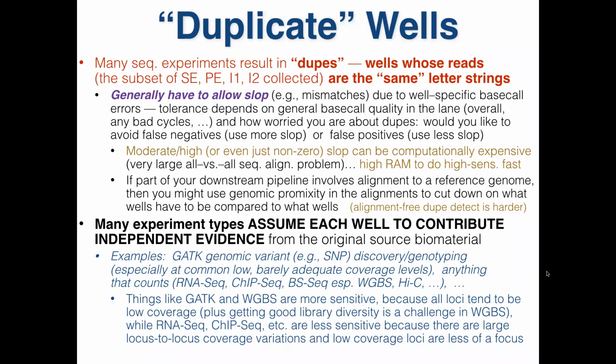that is one of the things that makes these hard to deal with, because if you haven't done anything else, you're very early in the processing of the lane, you haven't done alignment, maybe you're not even in a situation where alignments are a thing you're doing. I mean, the great divide in sequence applications is probably the methods that go align reads to a reference of some kind, reference genome of some kind, and then there's all the ones that don't. So that's sort of the first huge divide in terms of what path you're going to go down. The guys that go down the alignment to reference path have an easier way to do it.